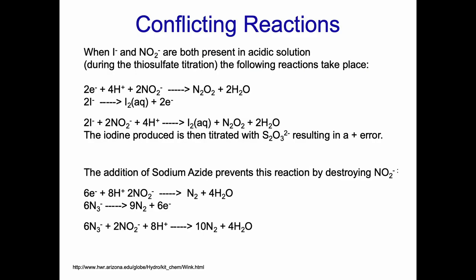So we add sodium azide. And that zaps the nitrites, converts them to harmless nitrogen and water. So that's the theory behind why we're using the azide modification. All that for these nitrites.